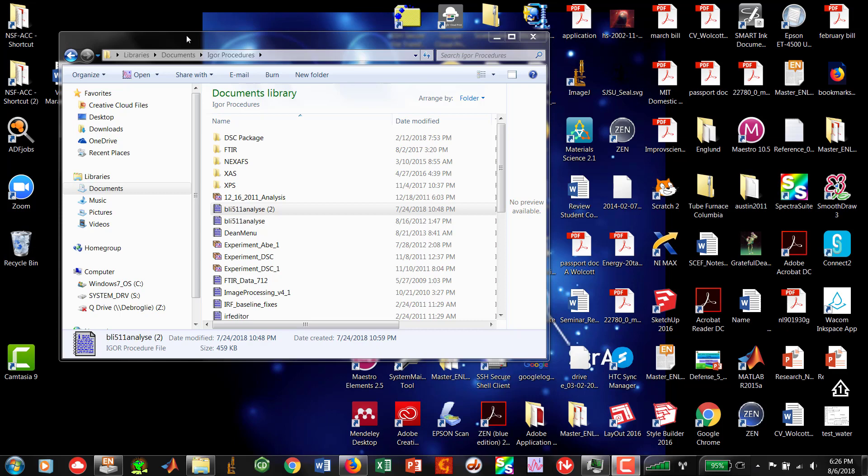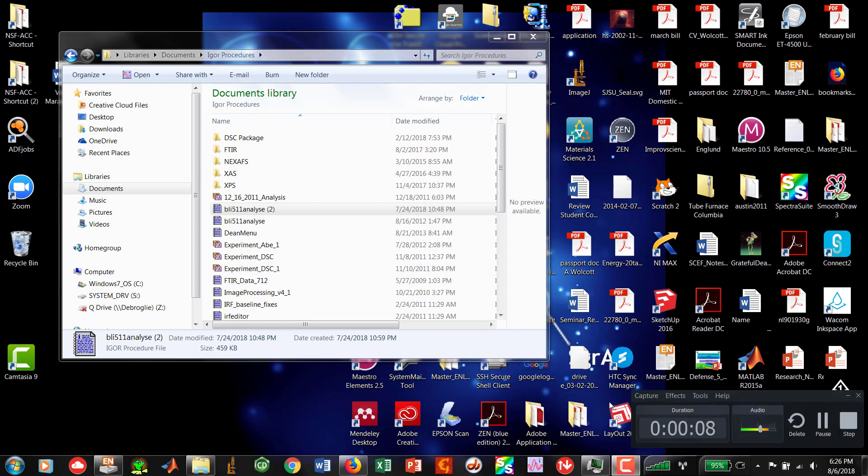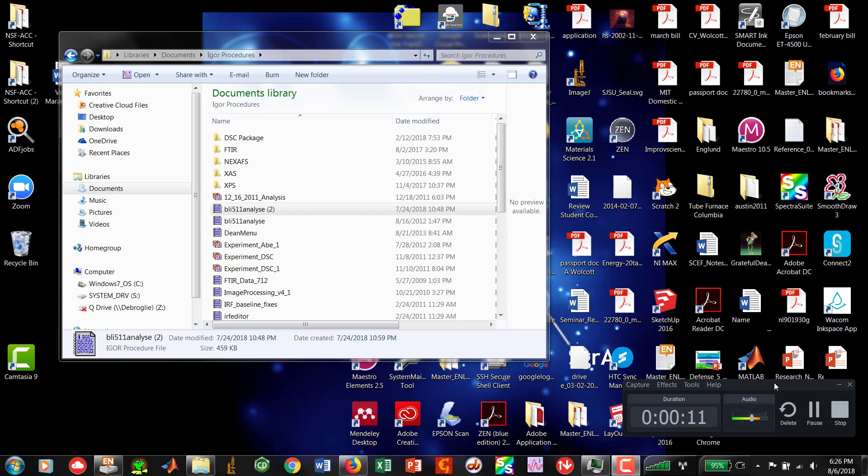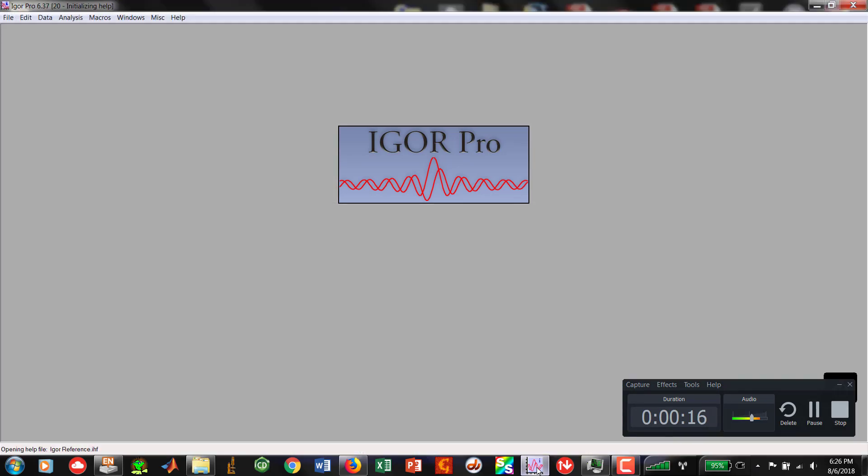Alright everyone, we are doing a recording for the use of our macro for our x-ray absorption spectroscopy data. Let's get right into it.